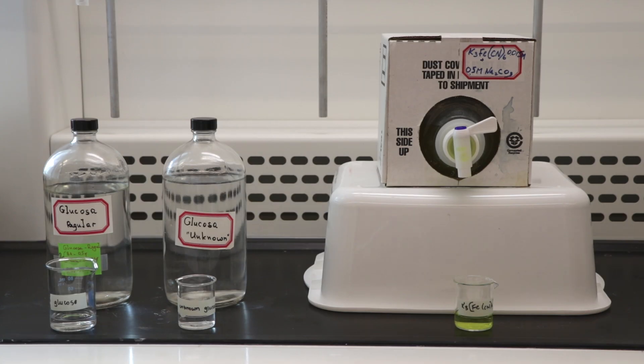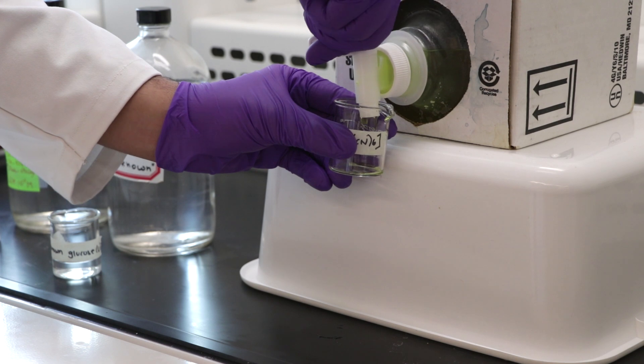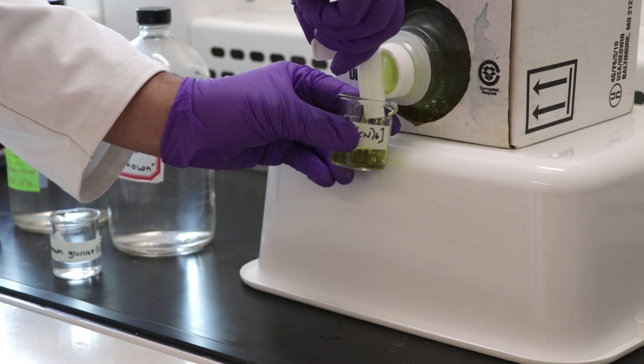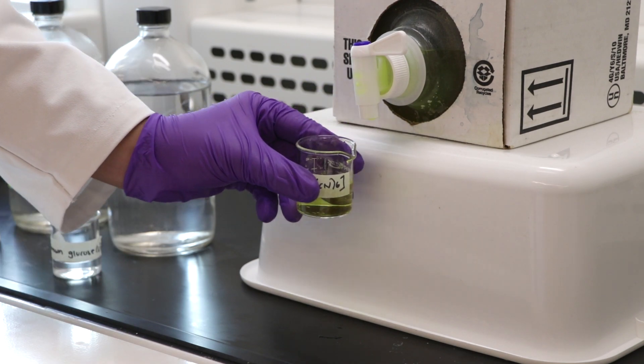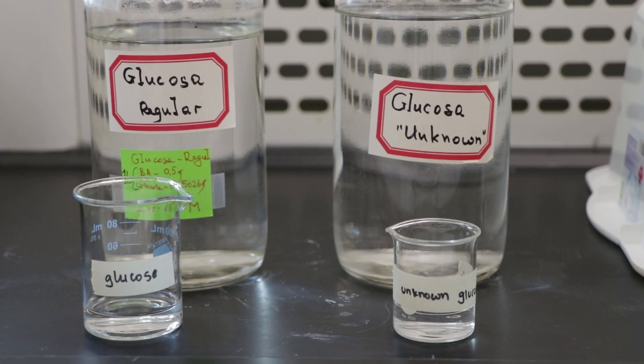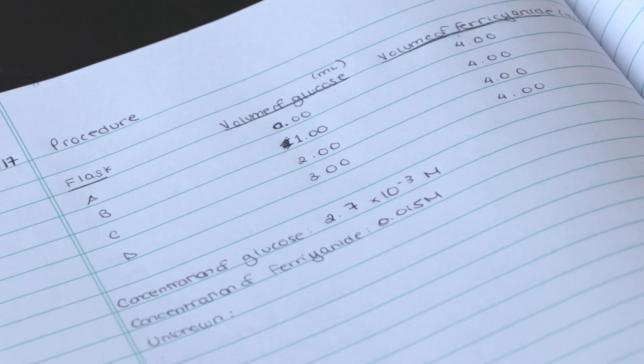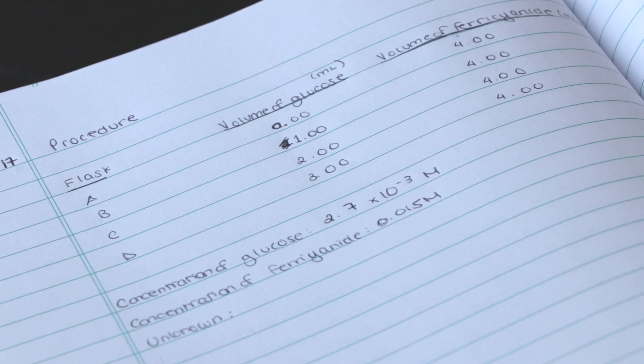The chemicals needed for this experiment can be found in the TA fume hood. Make sure to obtain only as much of each chemical as required with an excess of about 10 to 20 percent and label all beakers. Remember to record the concentration of the chemicals used in your lab notebook.